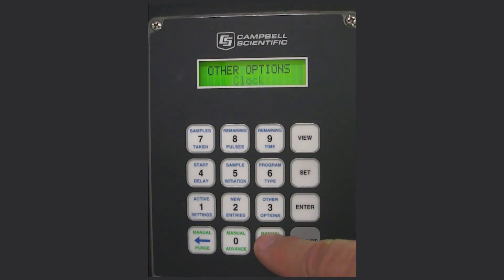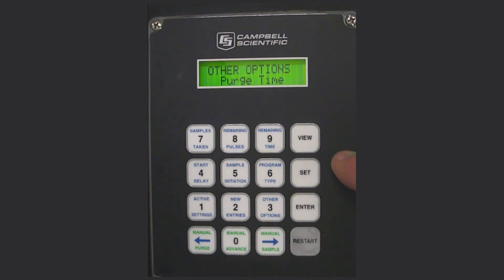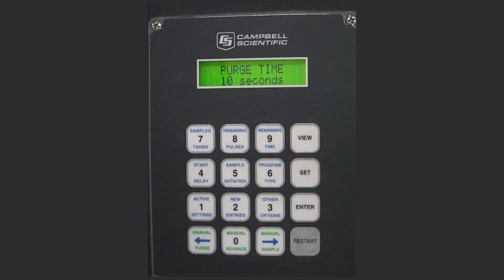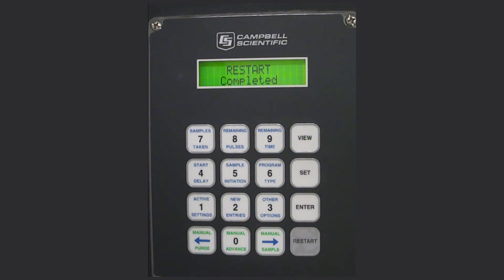Now to check purge time, push SET number 3 again and right or left arrow until you see purge time. It is currently set at five seconds. For a 25-foot hose you would need this set at 10 seconds — using the EPA's rate of two and a half feet per second into a 25-foot hose that equals 10 seconds. If your hose is longer, increase that time accordingly. Change the time to 10 seconds, press enter, then press restart once again and the sampler is ready to go.